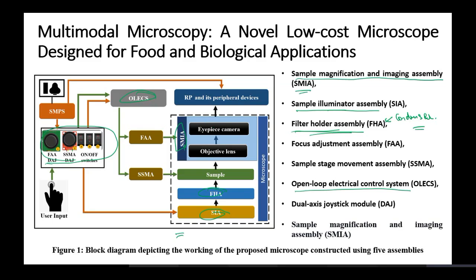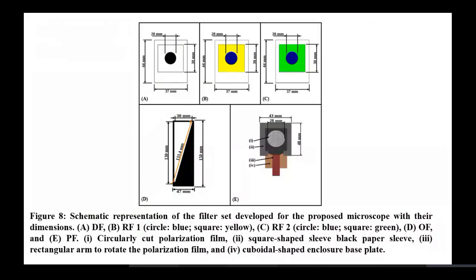Okay. Then from here we have this information going to the Raspberry Pi, which is a microprocessor which computes the images and helps us to take the image. Now, what is the advantage over here? The advantage is that we can use a series of filters, which allow us to take different types of images.